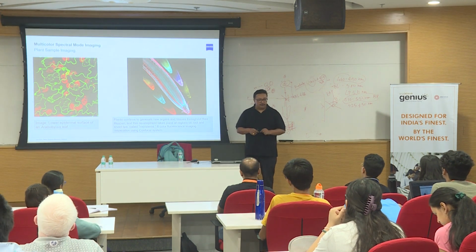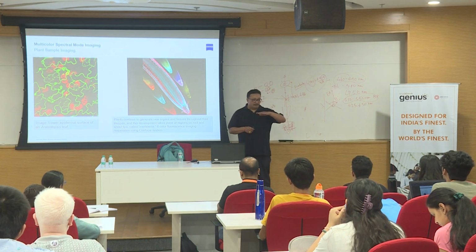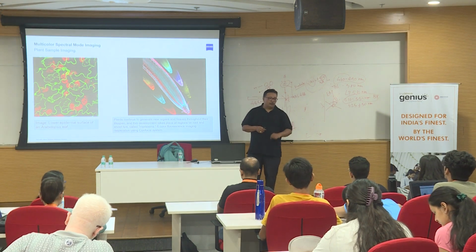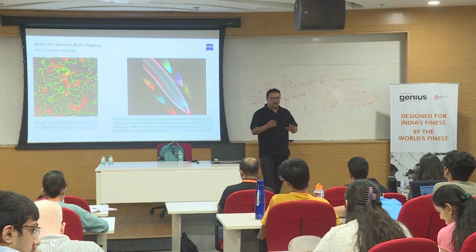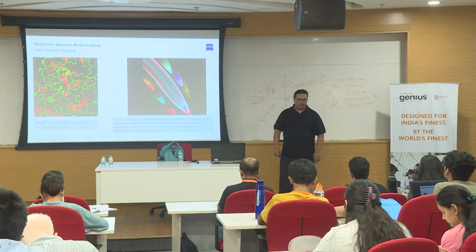You talk about depth, much better depth of penetration. Why? Because you have the pinhole, it ensures that you collect information from a single plane, laser being a coherent source of light, more penetrative, more energy, I can image much further deeper in my sample, I can generate photons from the depth, and I can create a volumetric rendered data out of it, or I can create a 3D reconstructed data out of it.